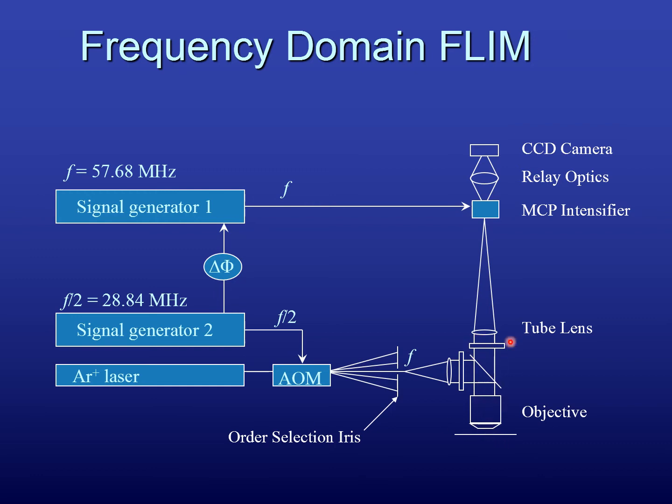And so it's basically still flashing a little bit after being modulated by the fluorophore now. The fluorophore, one thing that it will do is introduce a time delay on average, and this time delay you will then pick up. What you now do is you have this intensifier being driven by the same sinusoidal wave. If you assume this to be linear, you just get more signal when it's bright and you're also amplifying it than when it's dark and you're amplifying it, because then there's nothing there to amplify.